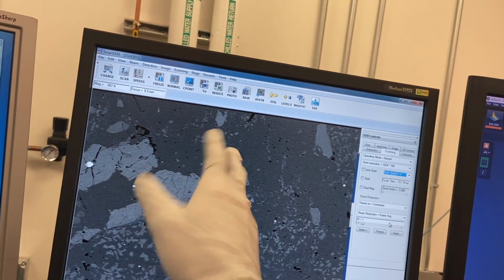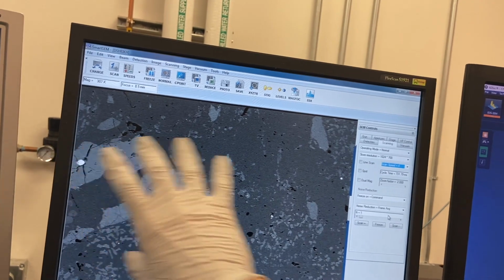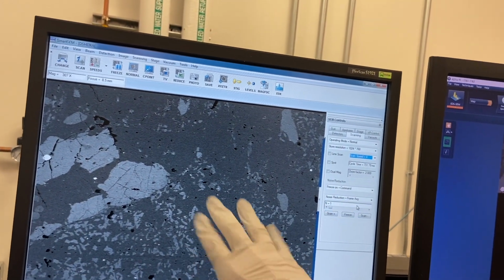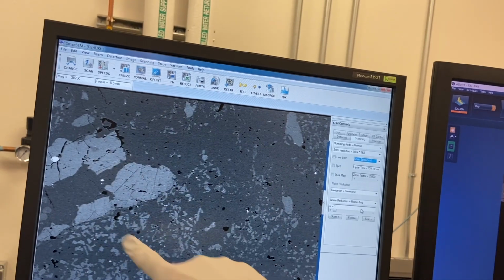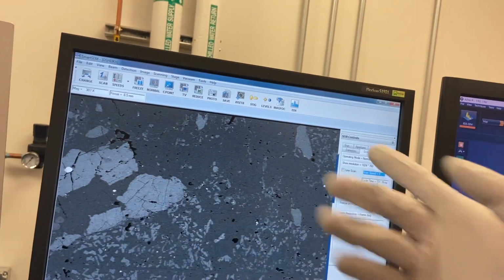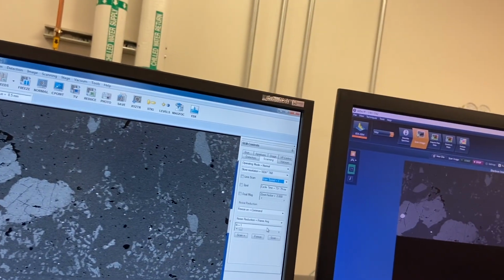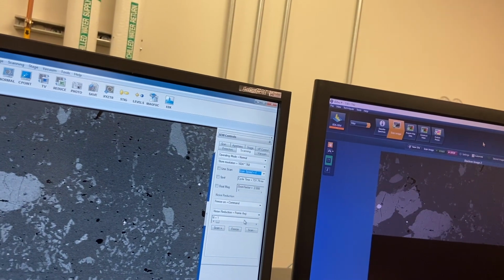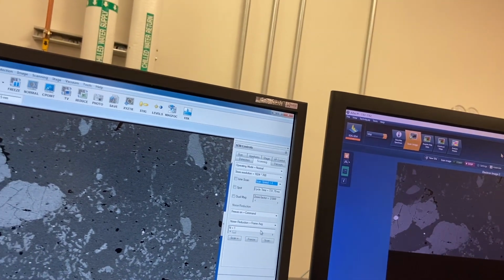You broke it up and then you melted it, and then that's like a remnant clast, and maybe this whole thing was like when you crystallized around the clasts. That could be why you have these sort of crystals that are aligned like this, right? These are things that, again, when you're classifying meteorites, you always have to consider what the sample could be, and you always have to think about different scenarios in your head.